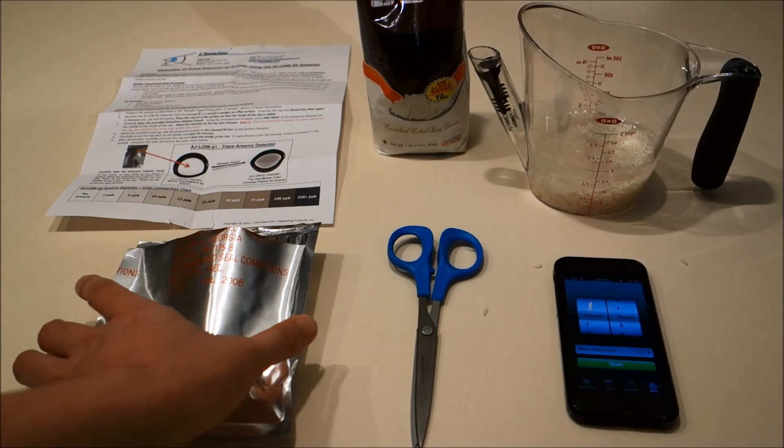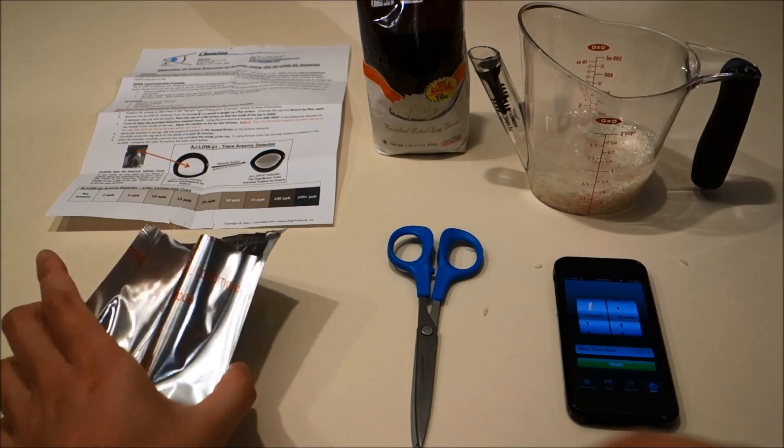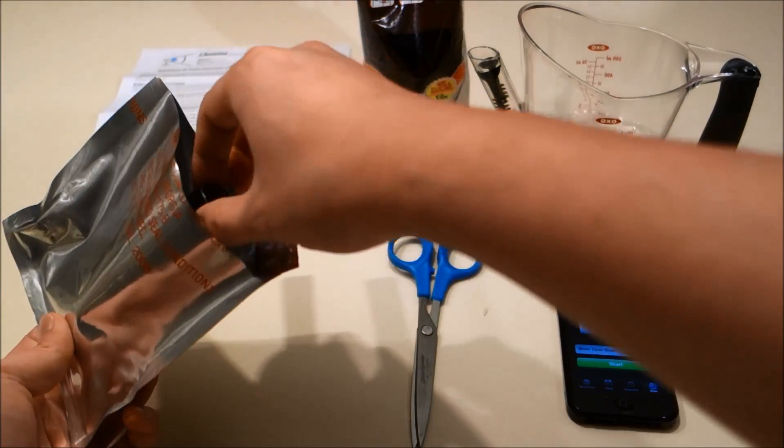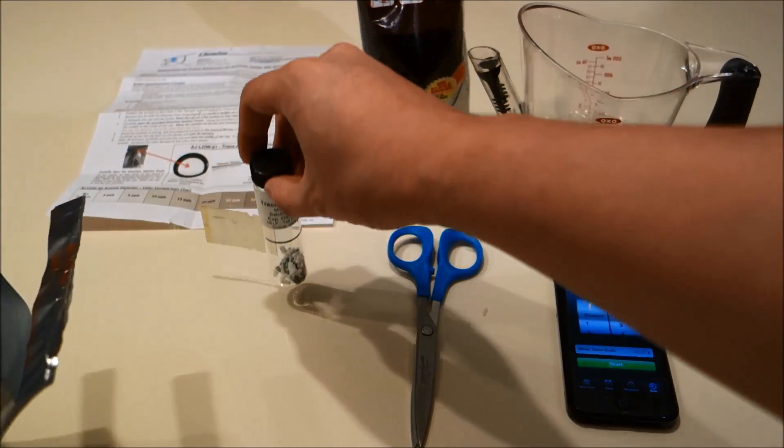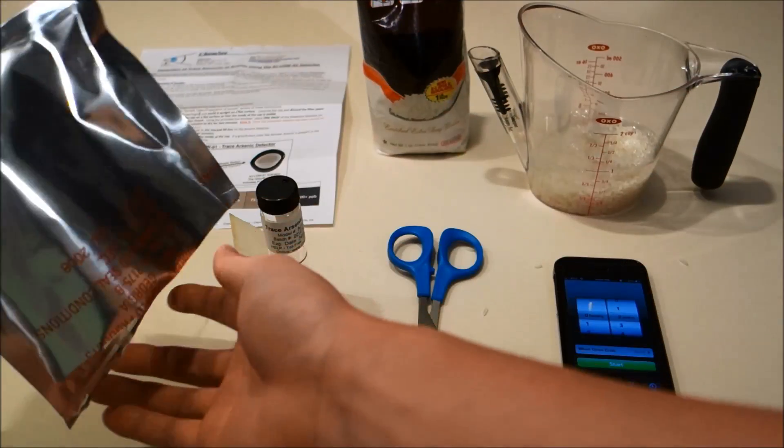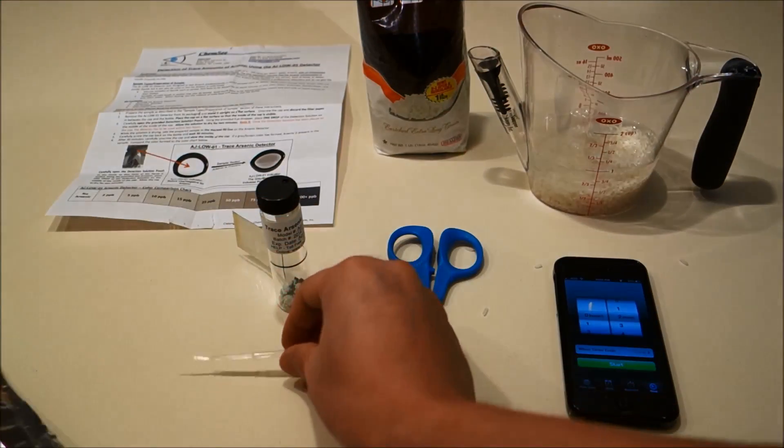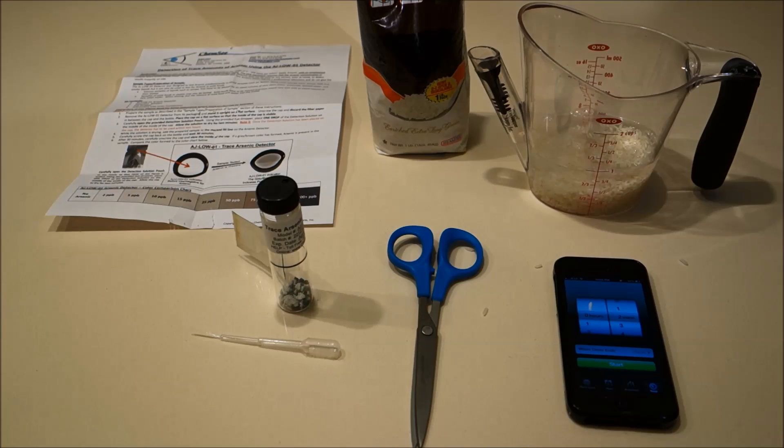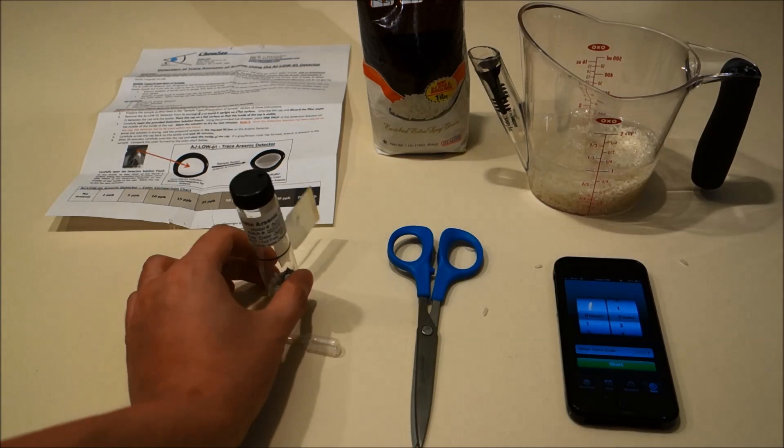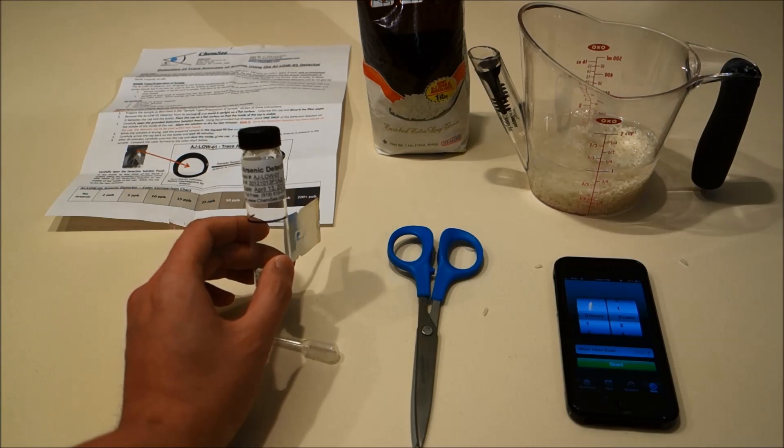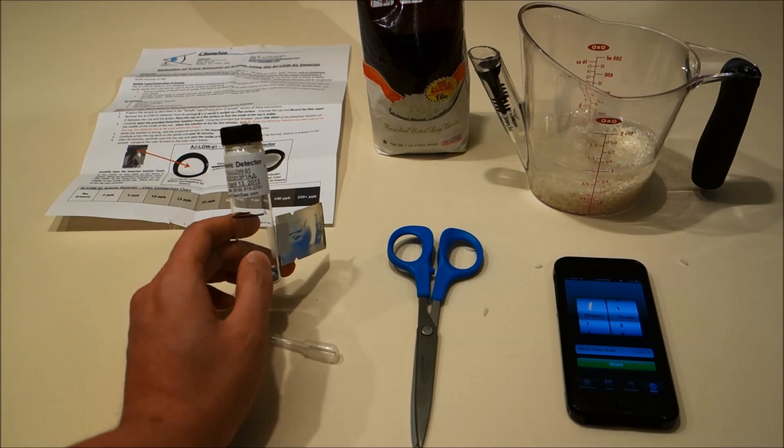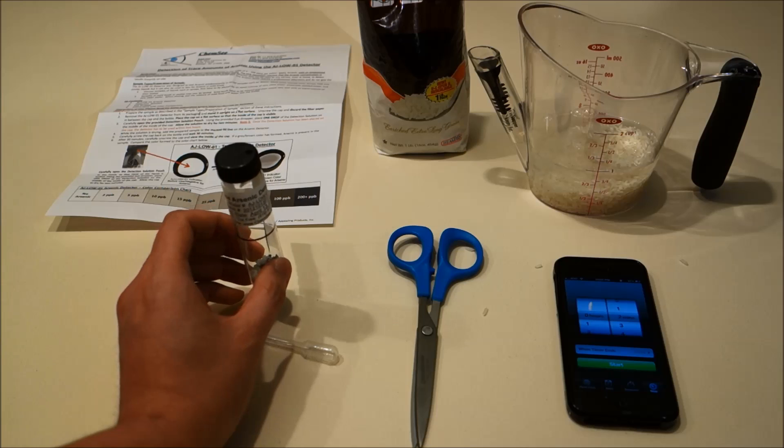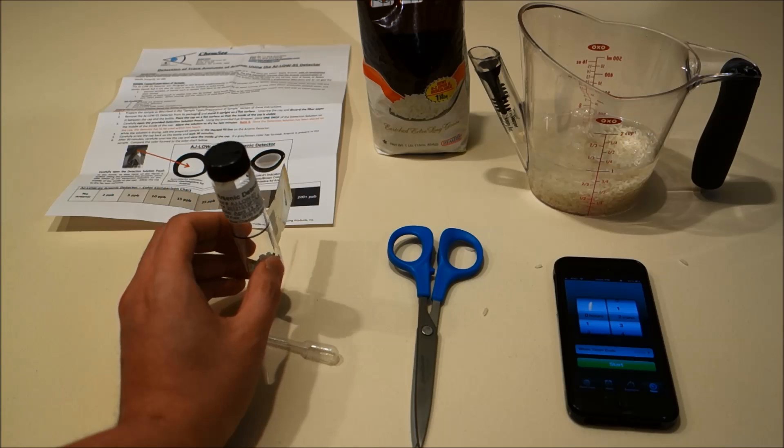In the meantime, we're going to remove the contents of the detector kit and place them on the table. Now it's very important that you do not shake or disturb the detector vial during the test or the results will be invalid.